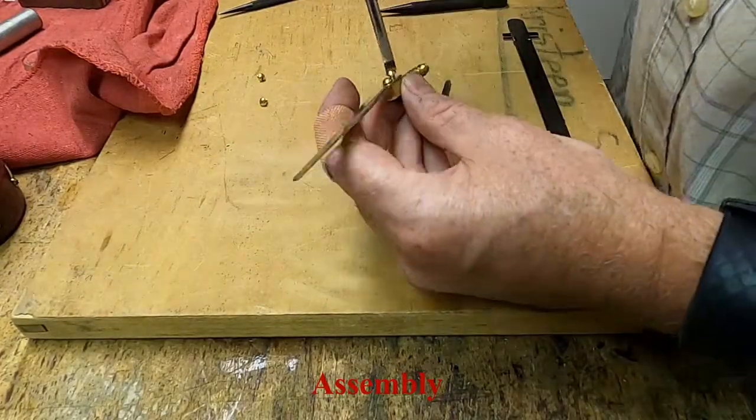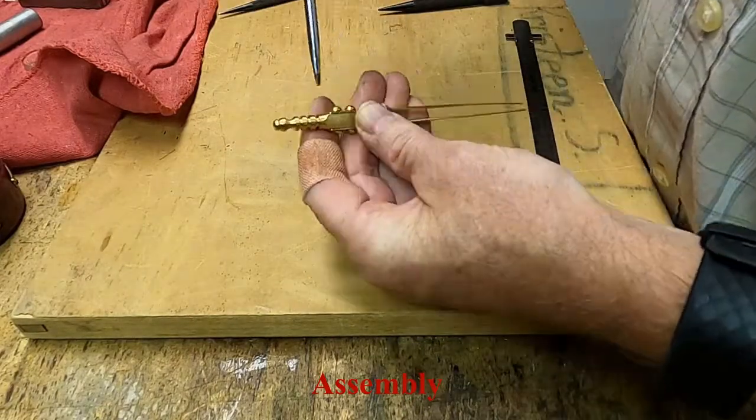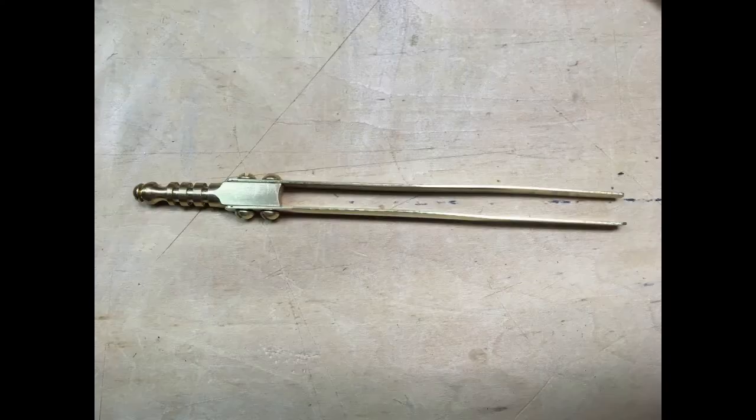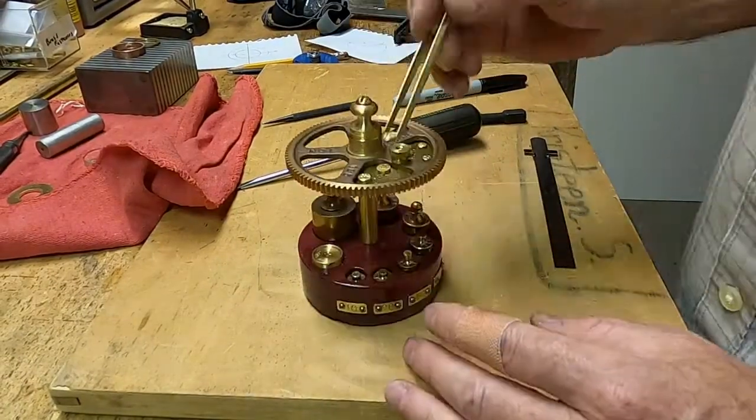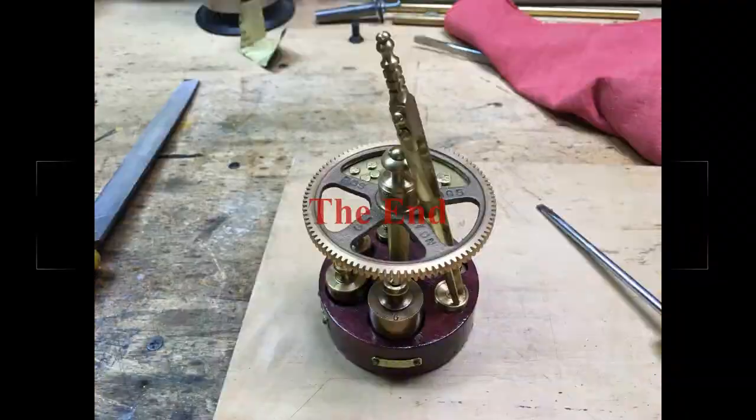The tongs are attached to the tweezer head using four No. 4-40 brass screws. And the matching brass tweezer for the Steampunk analytical balance is complete.